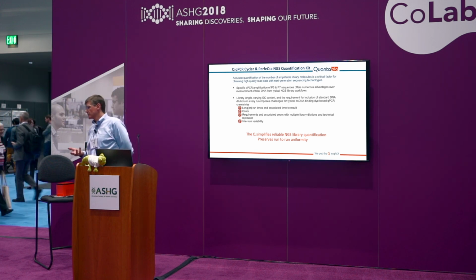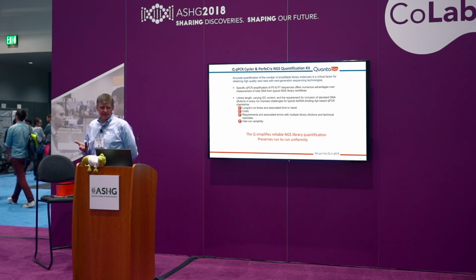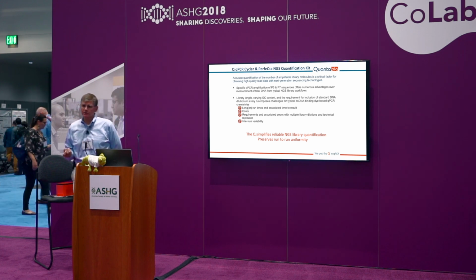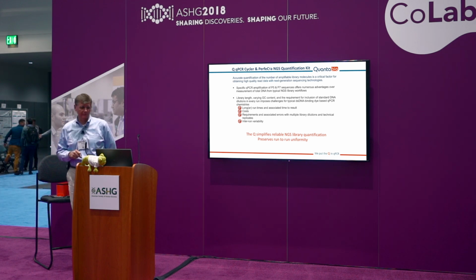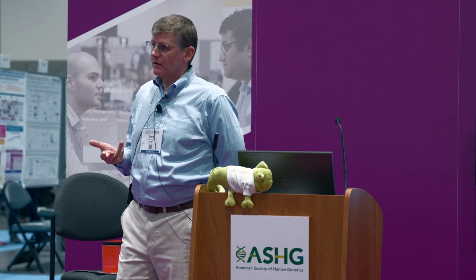There are a lot of people just getting by using Qubit or total DNA quantification. But depending on the integrity and quality of your library or the input starting amount, many people still find a need to use qPCR and to specifically amplify from the P5, P7 sequences in the adapters used for Illumina library workflows. So while it is a gold standard, there are some challenges to using the technique for library quantification.